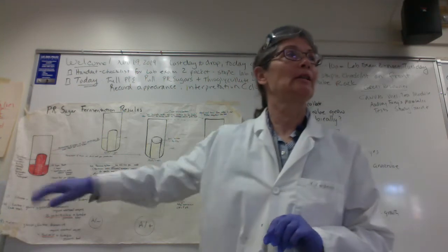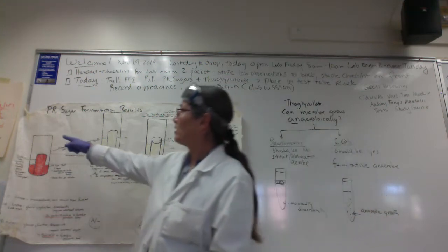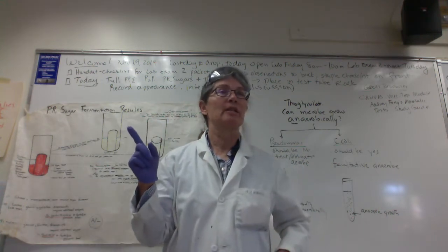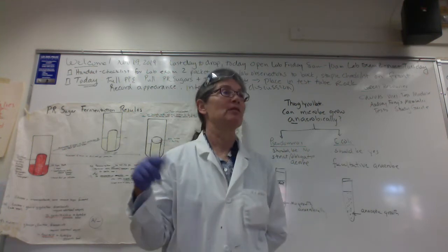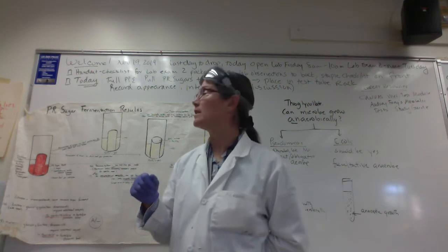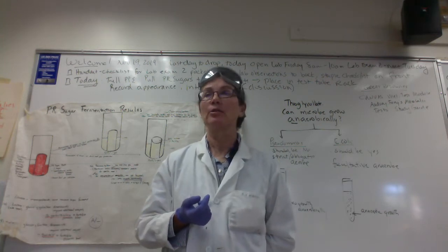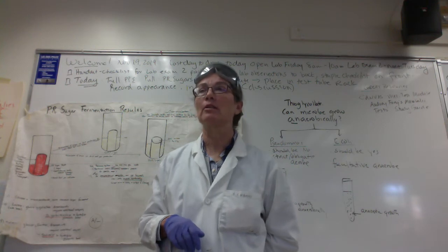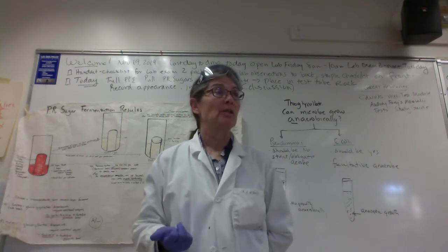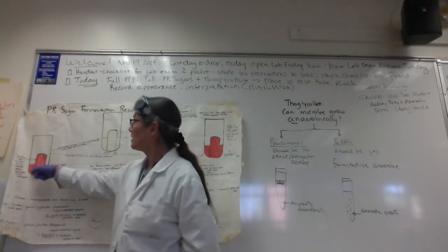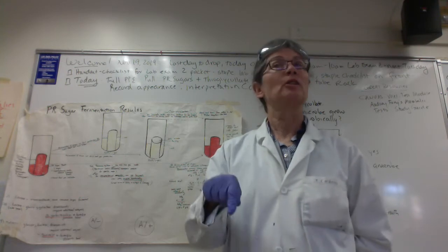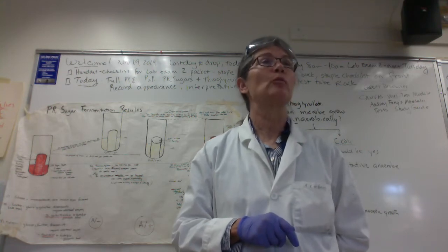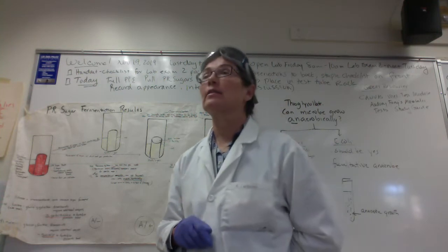So we're going to do the PR sugars first. We start out with our PR sugar tubes — there's only a single sugar present, and you'd know which sugar by the name: PR glucose, PR sucrose, PR lactose. In addition to the sugar, we have proteins and amino acids as an alternate carbon and energy source in case our microbe can't ferment the sugar. We also have the pH indicator phenol red. And there's this little inverted tube called a Durham tube — D-U-R-H-A-M — and its function is to collect gases made during fermentation.